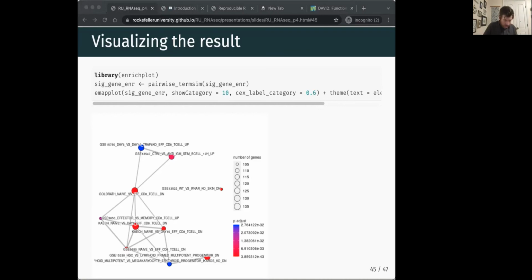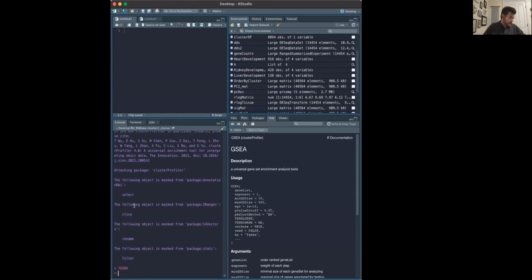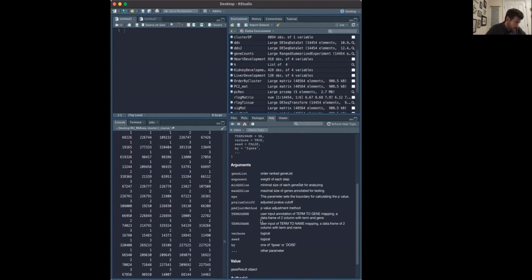Just sharing with you real quick. Okay, so if we go GSEA, does it have an option here?